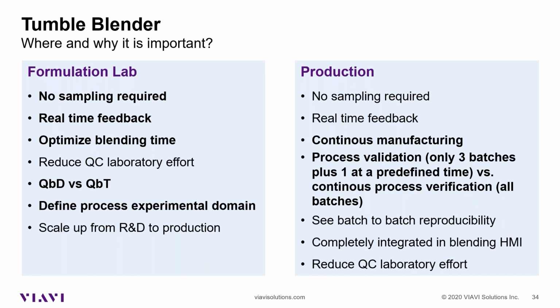it is important because we can apply quality by design, where the quality is built into the design of the product, that we saw as having a lot of advantages compared to quality by test, where we do the quality control just at the end of the process, and we can properly define the experimental domain.